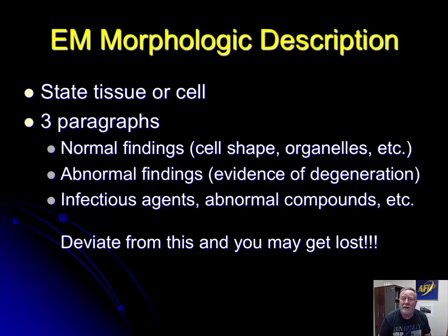Morphologic descriptions of an ultrastructural photograph are the exact same as a regular description that you would do for a slide, for those who are familiar with that particular process. There are a couple of differences. I will couch some of these slides in terms of that.